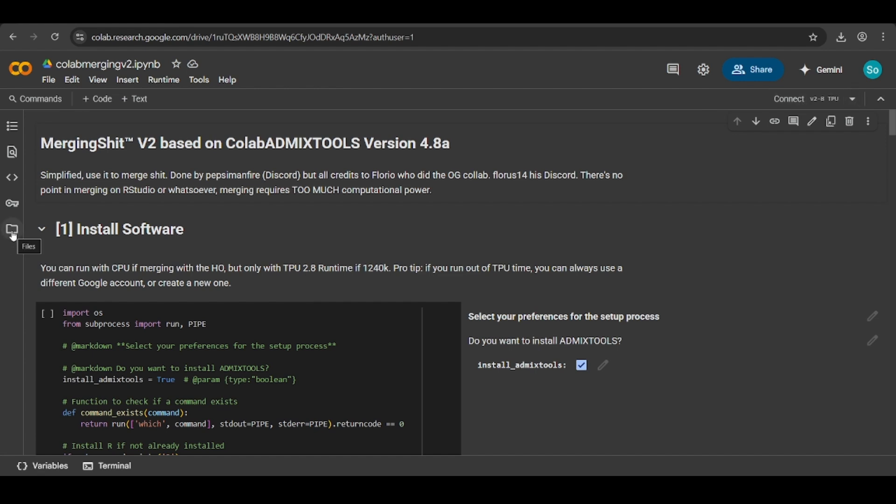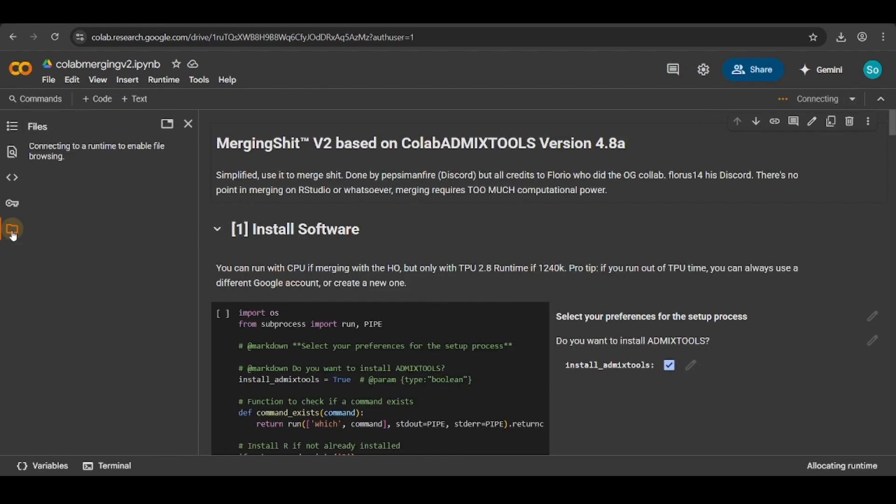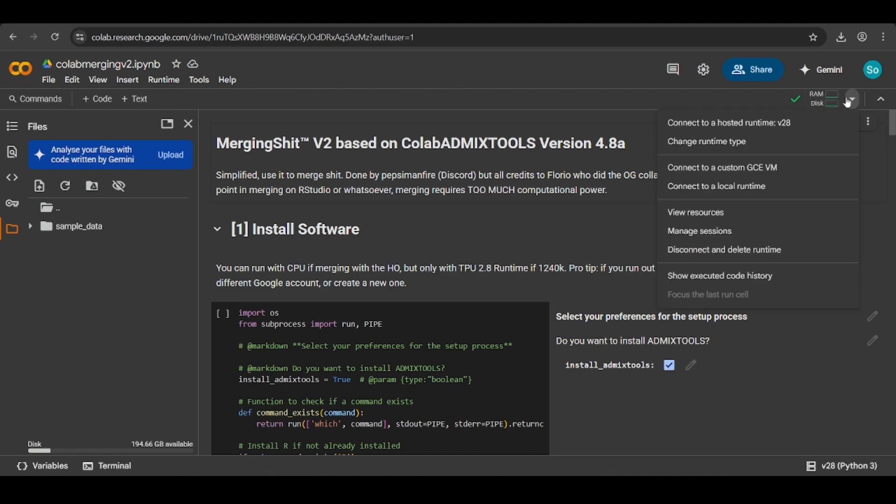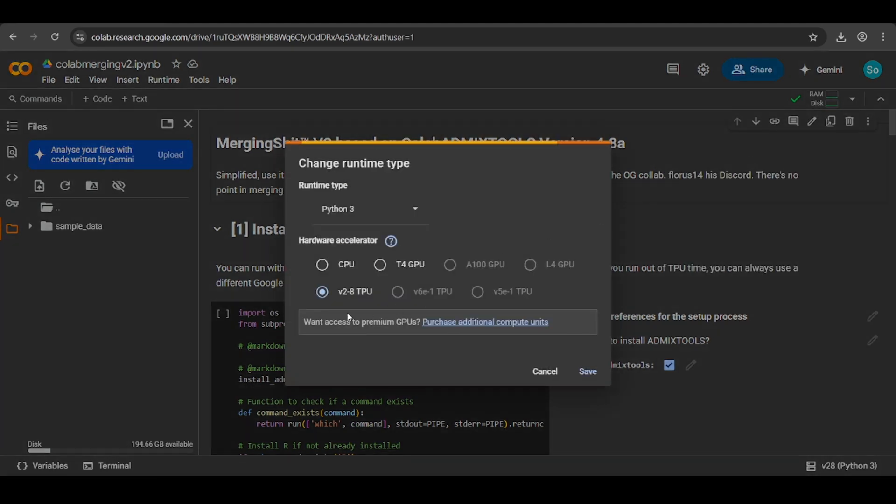First of all, open the files bar because we need to see the files. Second of all, you want to do this before you run anything. Click the down arrow, click change runtime type, and make sure the TPU is selected. This is because the TPU has more RAM and it allows you to merge the file. It will be pre-selected on CPU. If you leave it on CPU, the file will not merge. It will just not work.